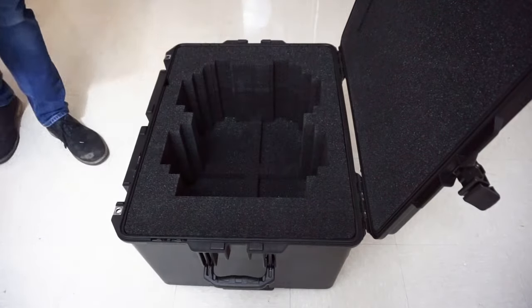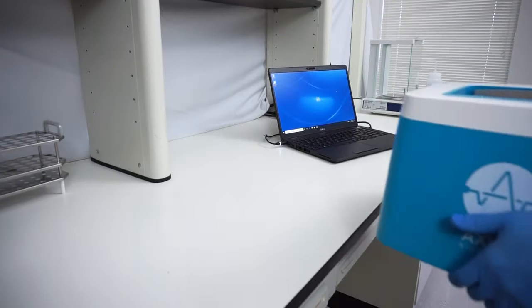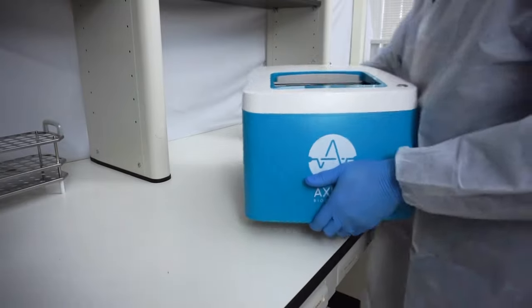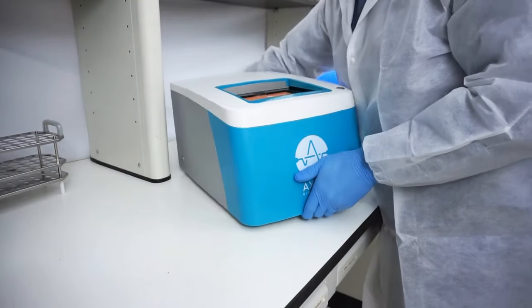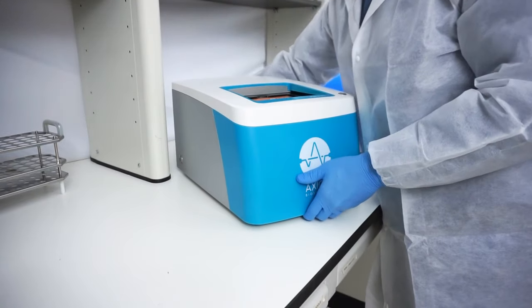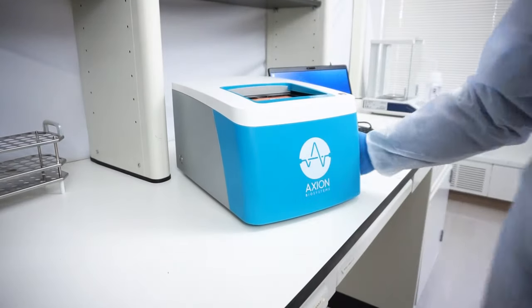In this video, we'll demonstrate how easy it is to set up the Maestro Z system and start running your first assay.